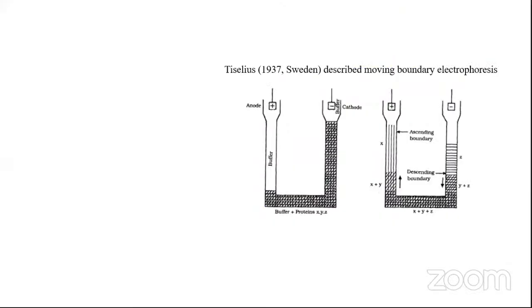We discussed in the last class how the Tiselius moving boundary apparatus is utilized for separation of different component target molecules.